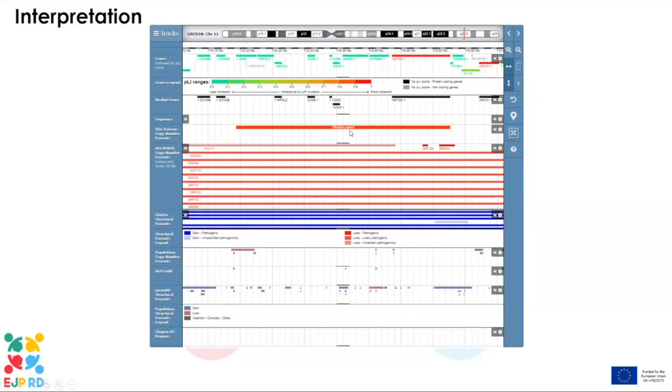If you're looking at a different type of variant, such as a CNV, you again get a genome browser. It has slightly different tracks because obviously you're more interested in, in most cases, larger variants. So in this case, we have a Decipher population copy number track, a DGV gold and gnomAD structural variant, a ClinGen dose sensitivity region, and also a ClinVar structural variant map. We can also obviously see all of the Decipher copy number variants.